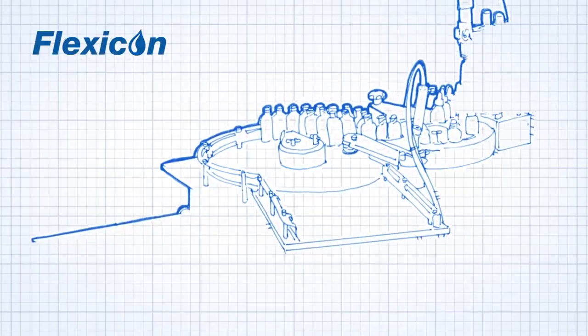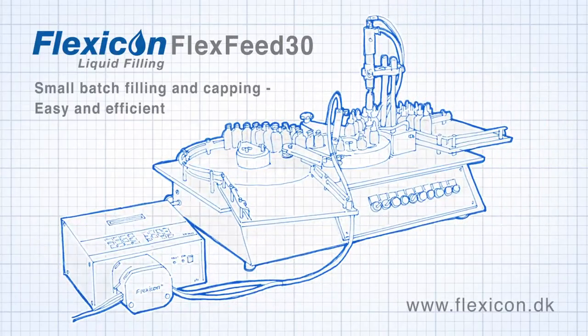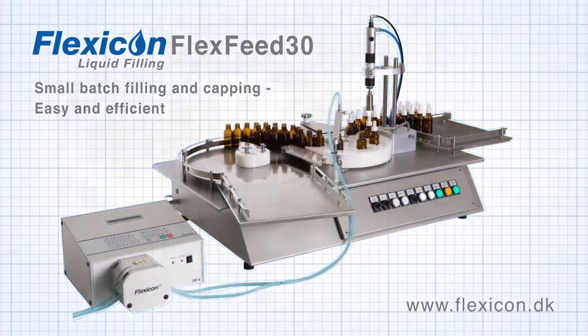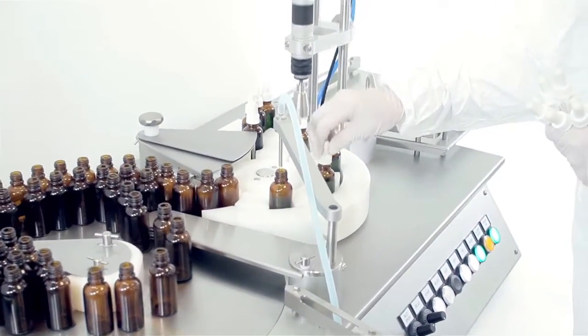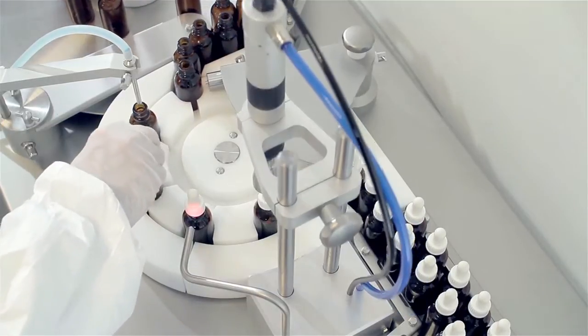The FlexFeed 30 is a tabletop bottle handling and capping machine that provides consistent cap torques, reduces operator repetitive strain injuries and is ideal for small-scale production.